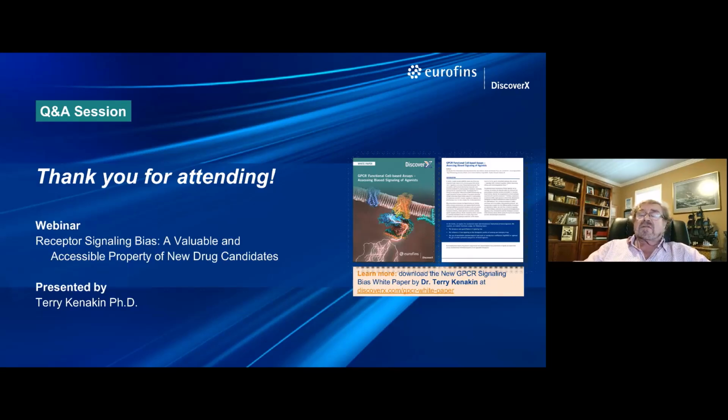Are you ready for the next question? I am indeed. Okay, this one's quite long. It says, there are now many biosensor platforms available to investigate biased GPCR signaling. However, results obtained with different biosensors can sometimes differ considerably, even when the same agonist, receptor, and cell line are used. So the question is, in your opinion, how should such discrepancies be interpreted?